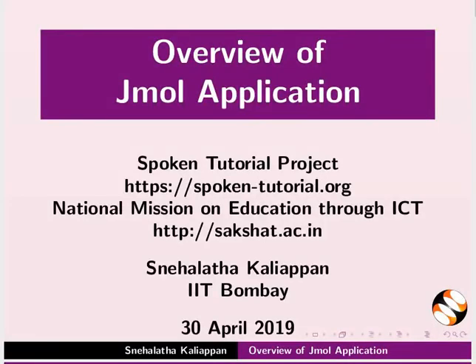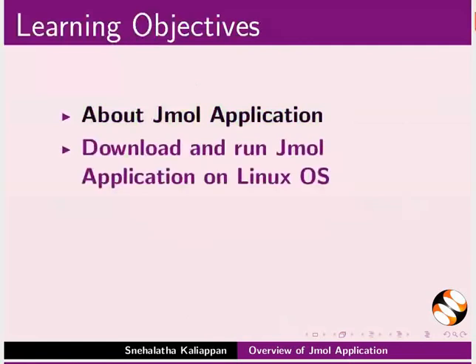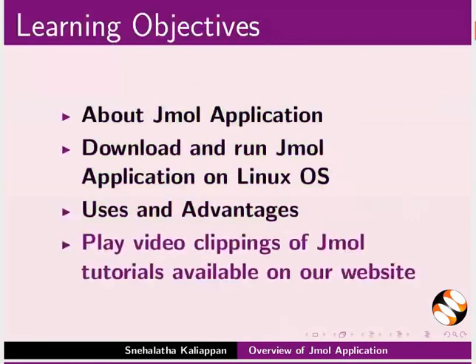Welcome to this tutorial on overview of Jmol application. In this tutorial, we will learn about Jmol application, download and run Jmol application on Linux operating system, uses and advantages, play video clippings of Jmol application tutorials available on our website.